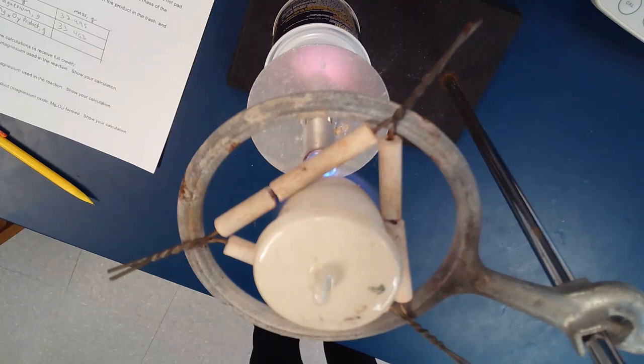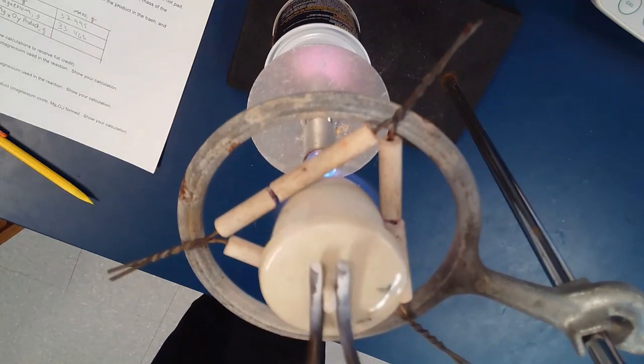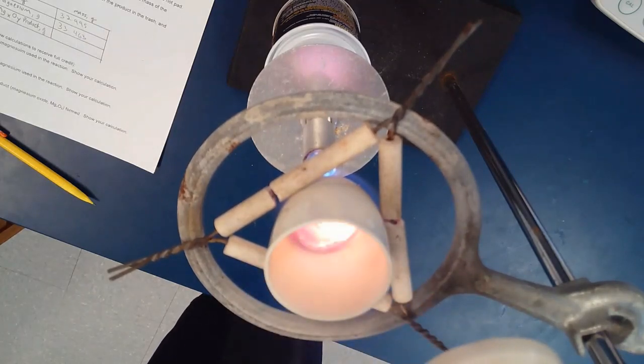So now what we're going to do is we're going to heat this magnesium up for at least 5 minutes in the crucible. And so we're going to pause the video, stop the video, and we'll come back 5 minutes later. So you don't have to sit here. Just one more look.